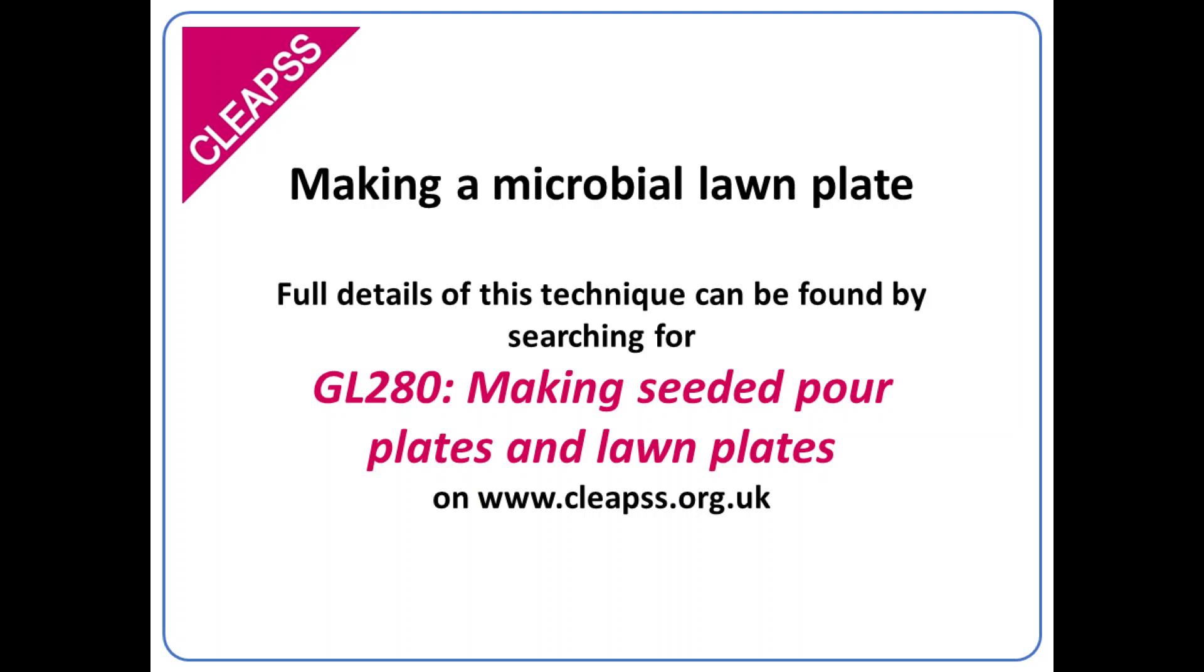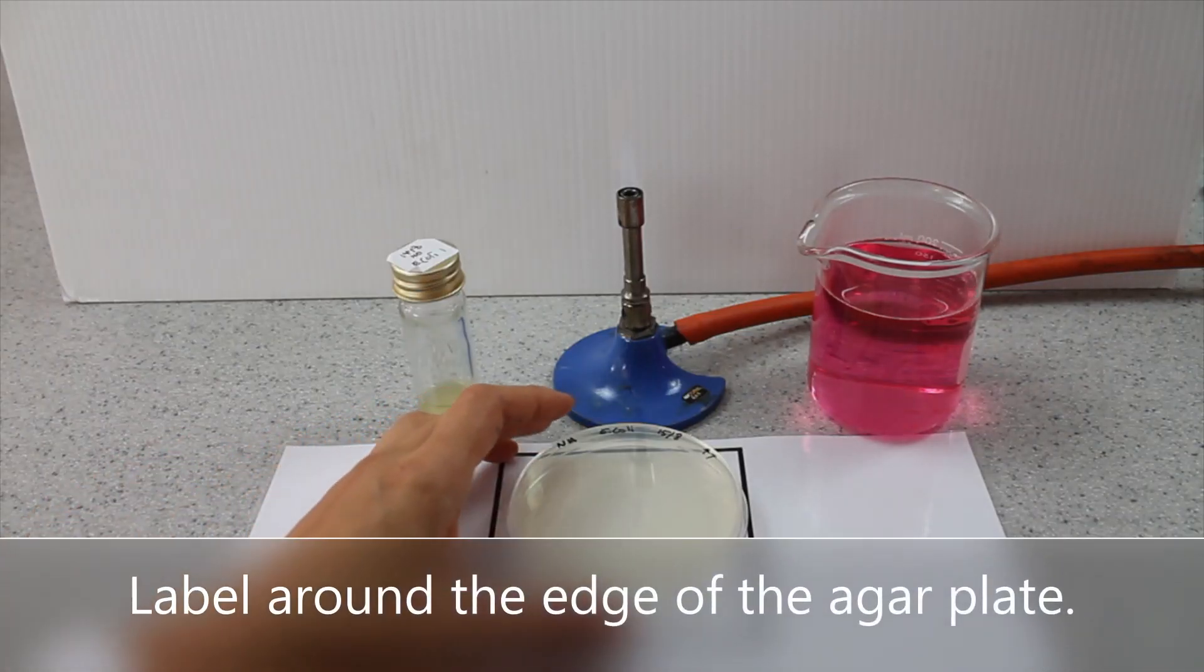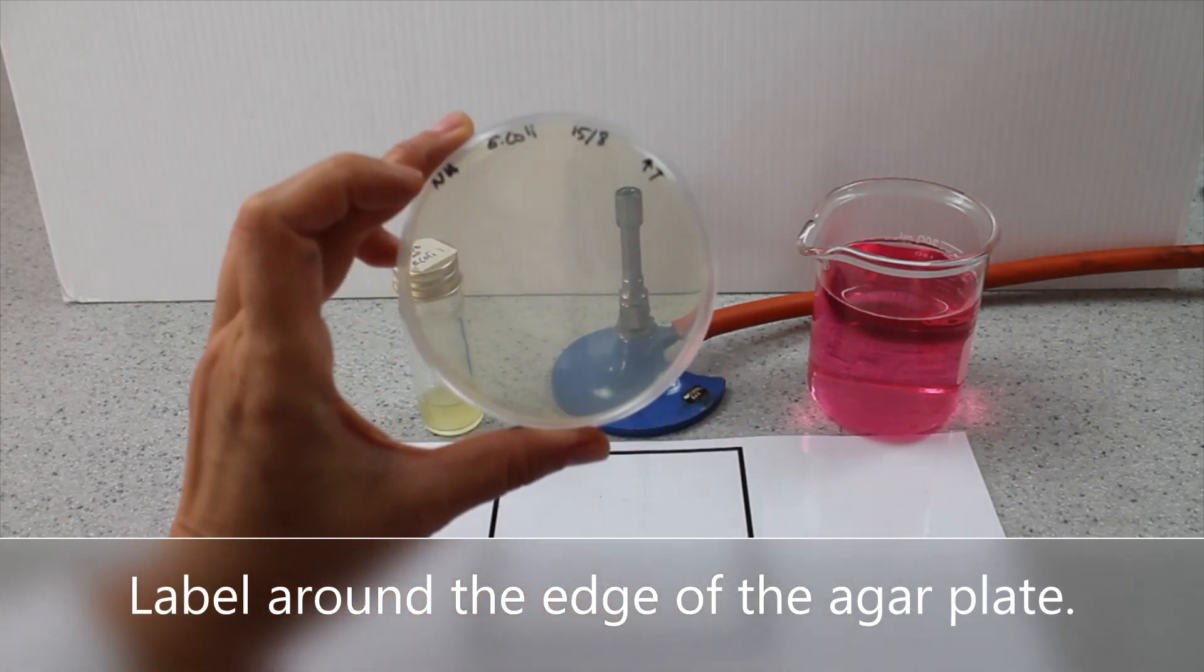Making a microbial lawn plate. Label around the edge of the agar plate.